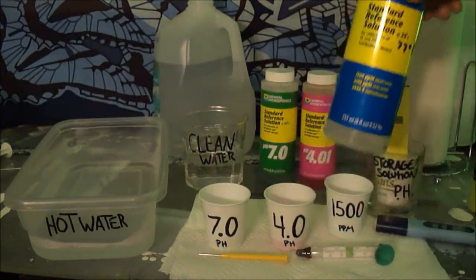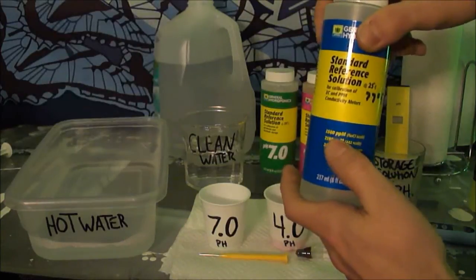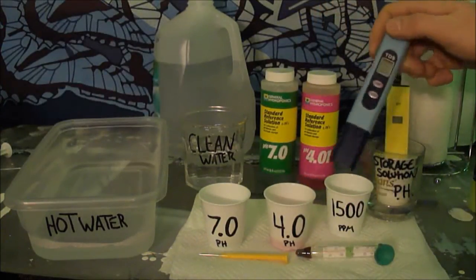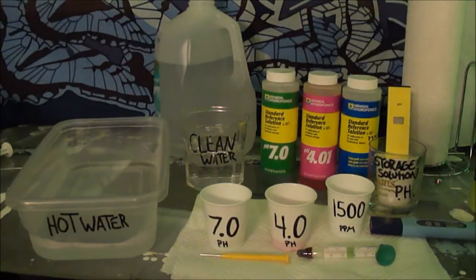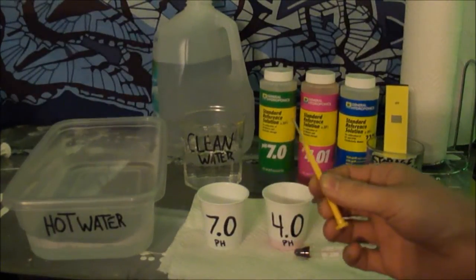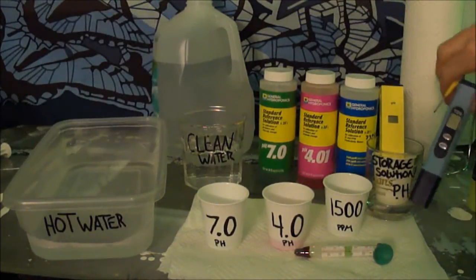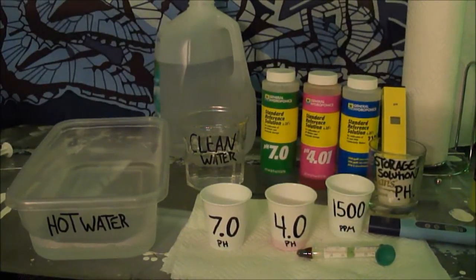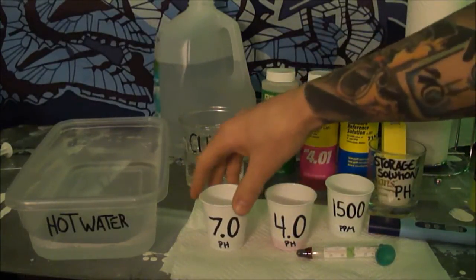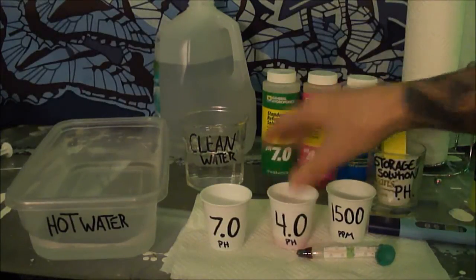For your total dissolved substances reference solution there are three different ways to measure, and I'm going to use the 1500 parts per million for this blue pen right here. All you need is the little screwdriver that comes with the meter. These came together off eBay for $20, so you get what you pay for — you have to calibrate them quite often. You just pour the reference solution out into the little cups.